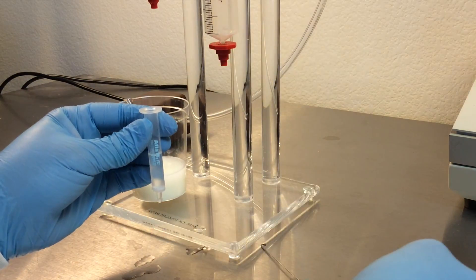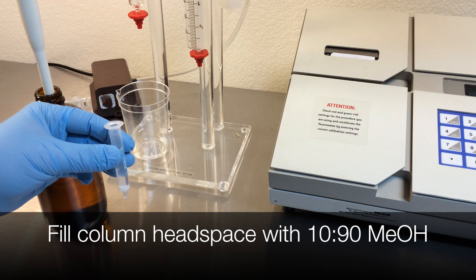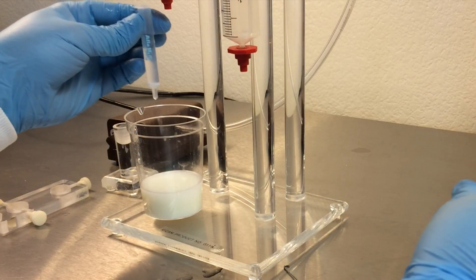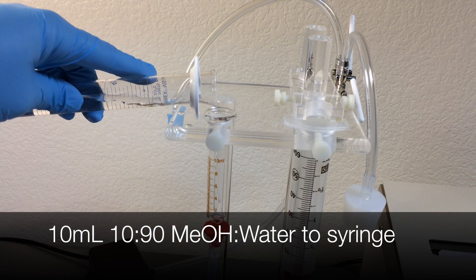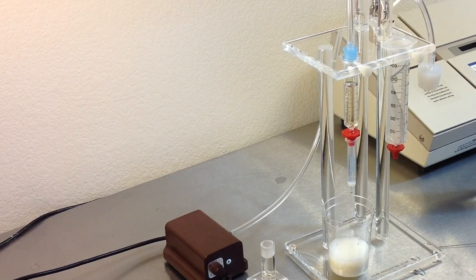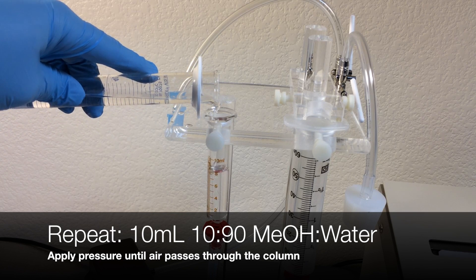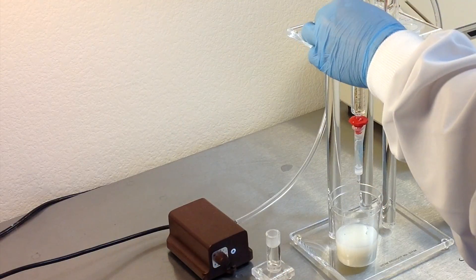Remove the top cap from the column. Fill the column headspace with 10-90 methanol and water and place the column back onto the glass syringe barrel. Use the markings on the syringe barrel to measure 10 milliliters of 10-90 methanol solution. Pass two to three drops per second until air passes through the column. Once air passes through, repeat the last step: remove the pressure, add 10 milliliters of 10-90 methanol and water solution, then apply pressure and pass two to three drops per second until air passes through the column.